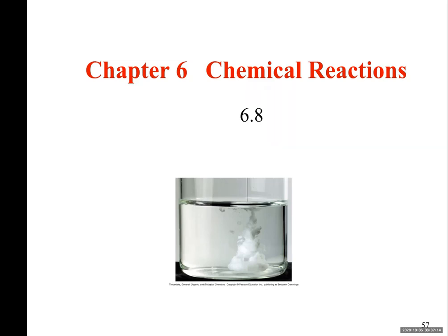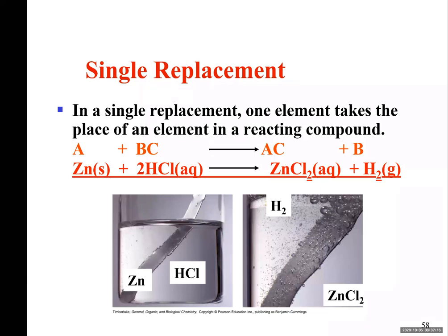Again, we are focusing on chemical reactions. On this reaction, you are taking a zinc. This is a strip of zinc metal. This is zinc metal.